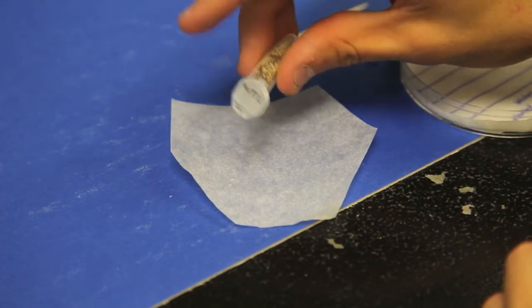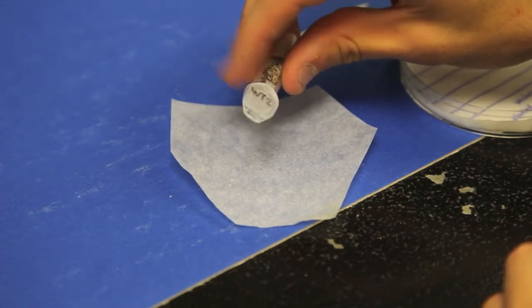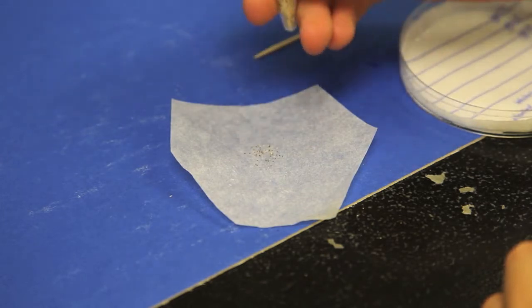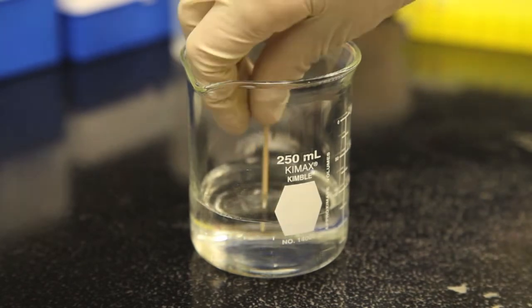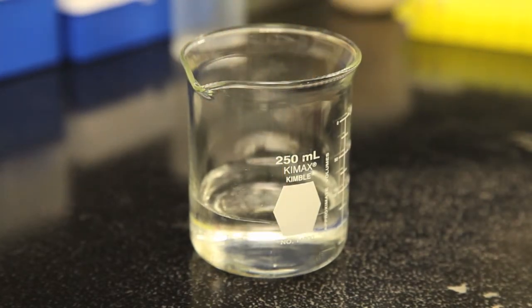First, sprinkle some seeds onto a piece of wax paper or regular paper. Be careful not to sprinkle too many. You can always add more if needed. Next, use a container of clean water to dip the very tip of a toothpick.